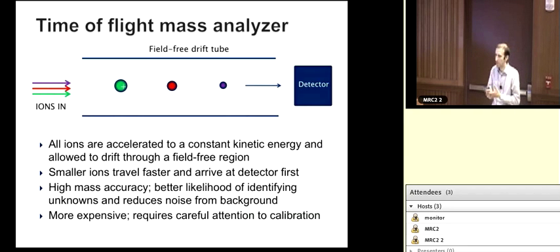So if you're trying to measure a low-level carbohydrate with the same mass as glucose in a method that puts all of your carbohydrates right around the same place in your analysis, then you might have a problem. And so we need to deal with that on the front end and in the separation context.